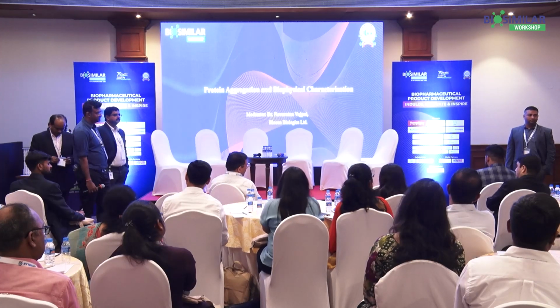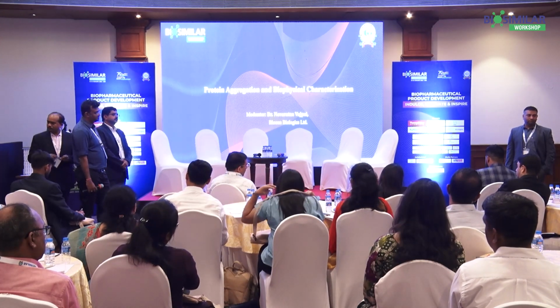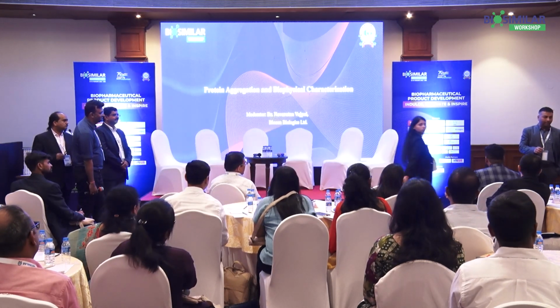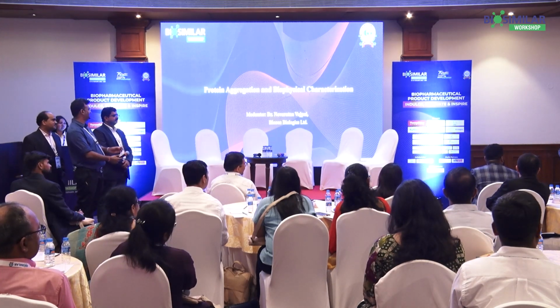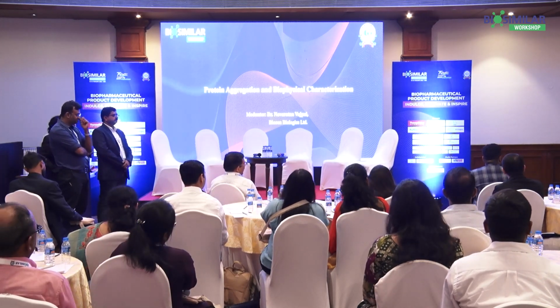And specifically when we are demonstrating biosimilarity, it gets nullified, because if it is happening at all, it would happen for the comparator also. Yes. So thank you. Thanks for that. NMR for that, and that is why these techniques are orthogonal. Actually, NMR holds an advantage there, because the higher the concentration, the better the sensitivity. So, thank you.